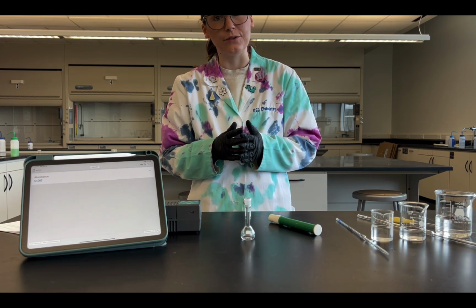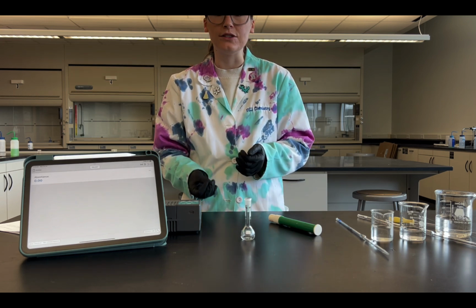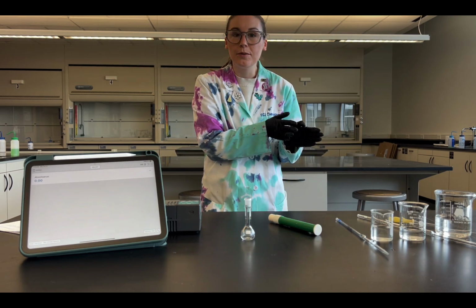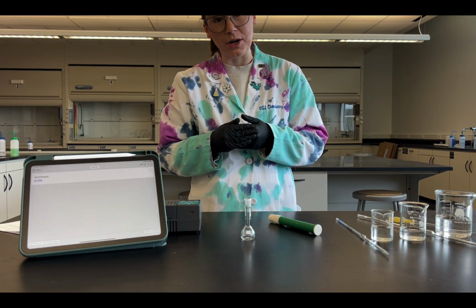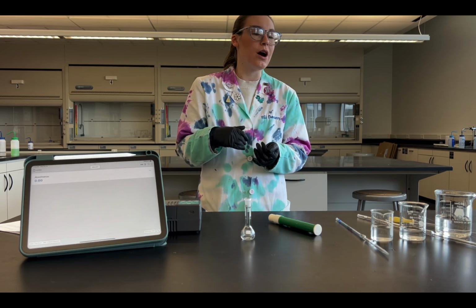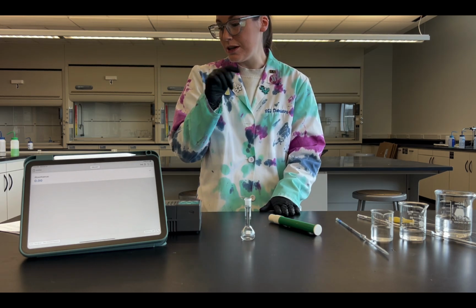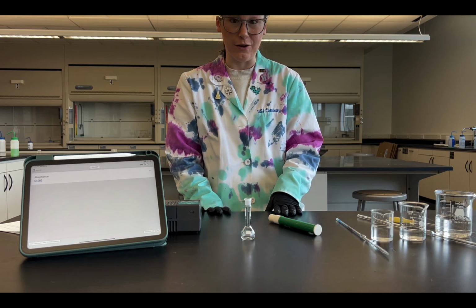So when you're doing this virtually, or if you're doing it in person, please make sure you are using the correct concentrations for those solutions and plugging them in properly to your dilution equation. The concentrations from part 1 are different from our concentrations from part 2, so they are different numbers. If you don't use those different numbers, you're not going to get the right concentrations. It's going to throw off your entire ICE table and you won't get the correct answer. So make sure you are looking at those different numbers, noting them, putting a little star next to them, whatever you need to do to remind yourself that they are different.